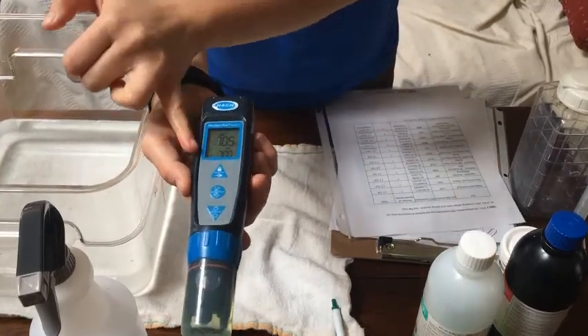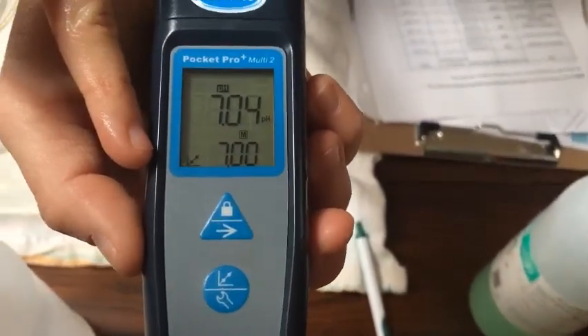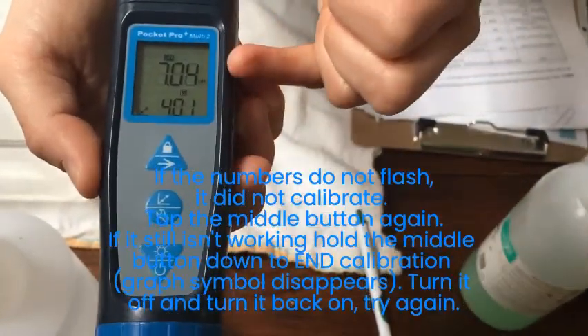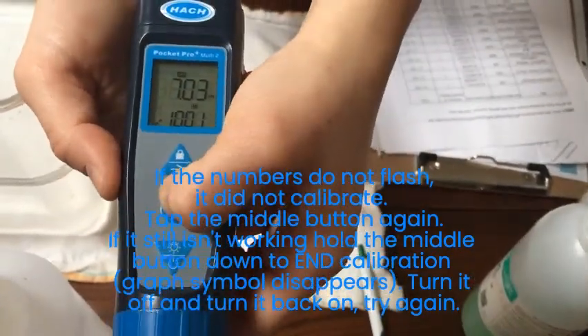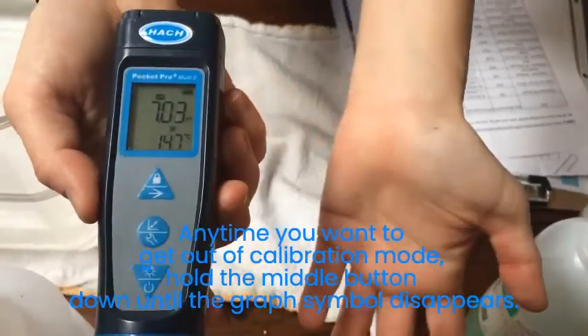You should see this calibration symbol, which is the little graph down in the corner. Then you just tap it once and it should flash, showing you that number. Now you know it's calibrated. To get out of calibration, hold this button down until it says 'end.' And now it's calibrated.